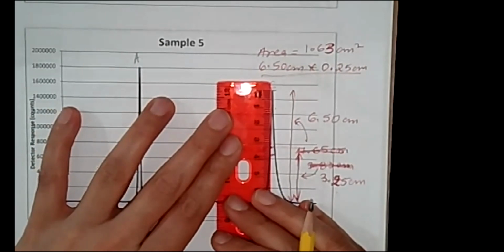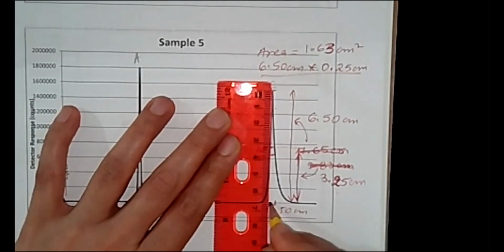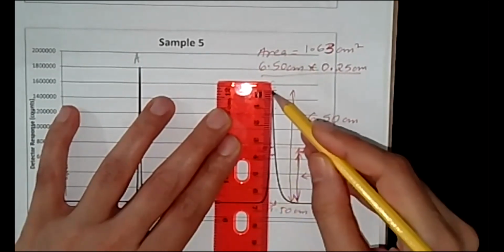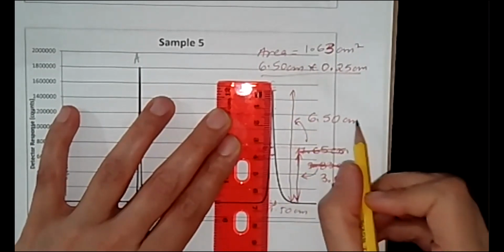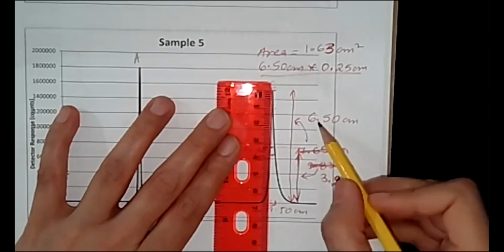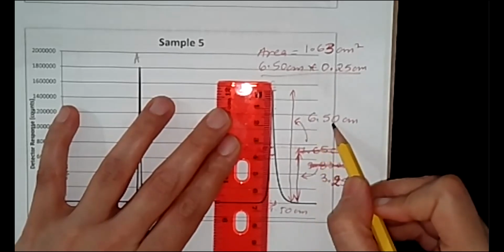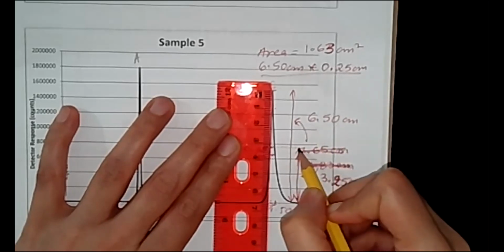Place your ruler at that place and figure out the total height of the peak in centimeters. Since the total height is this, I will divide the total height by 2 and figure out half of that height.